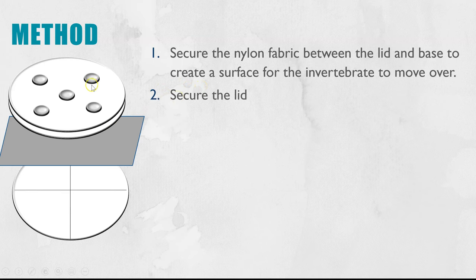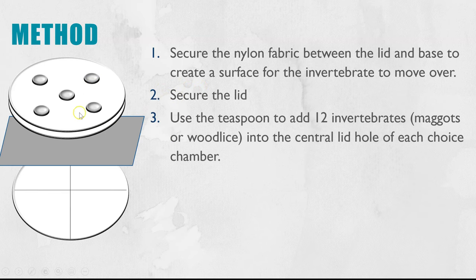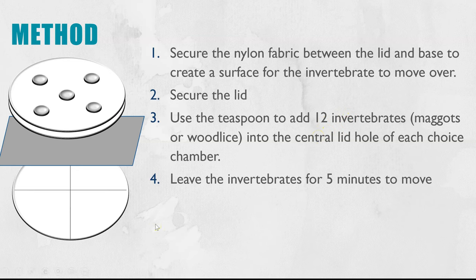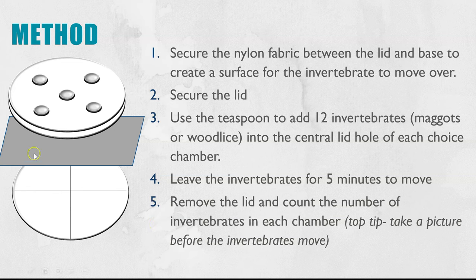Once we've got that nylon sheet we then put the lid down and secure it shut. You then would use a teaspoon to insert your invertebrates into the middle hole so they're right in the center to begin with and in this case I'm using 12 because that's what AQA suggests in their handbook. Once you've done that you leave it for five minutes, you can slightly alter that time depending on your lesson length, and then after that time take the lid off and count how many invertebrates are in each of the different chambers. I recommend taking a picture before you do that because the invertebrates will still be moving and therefore you won't necessarily get the most accurate results.